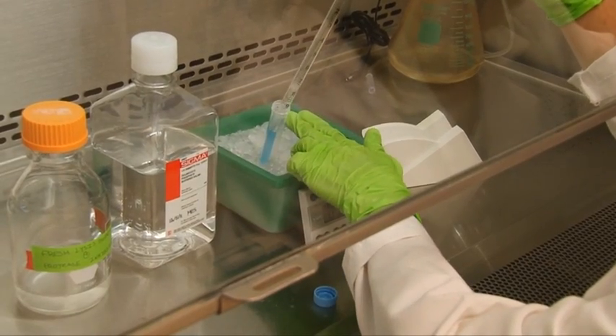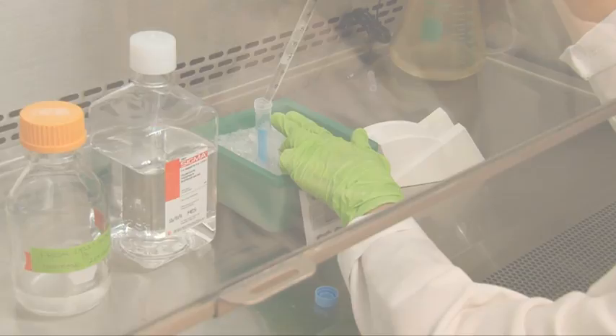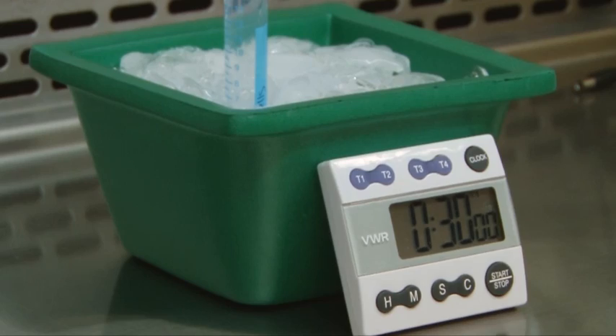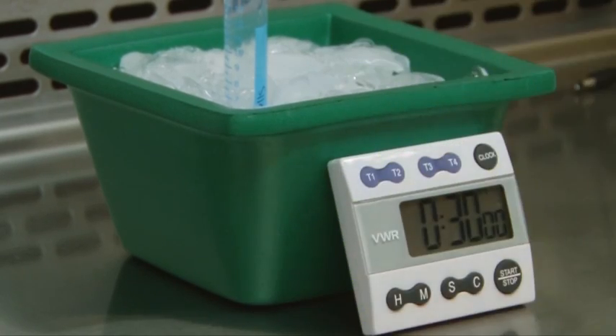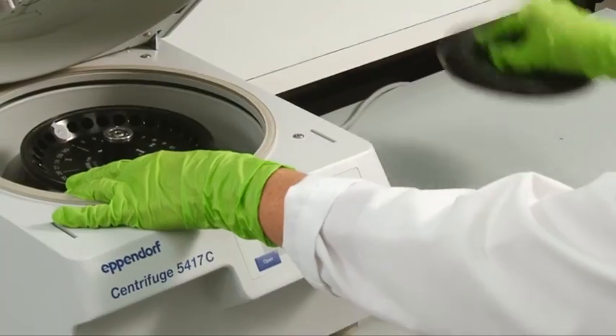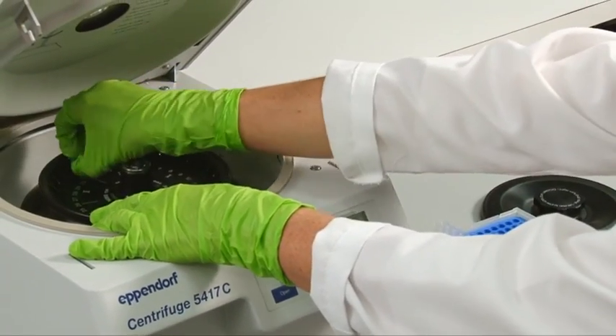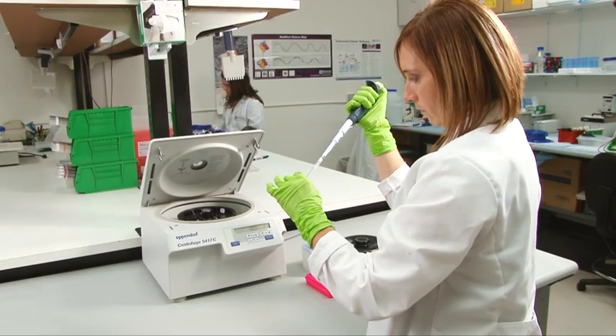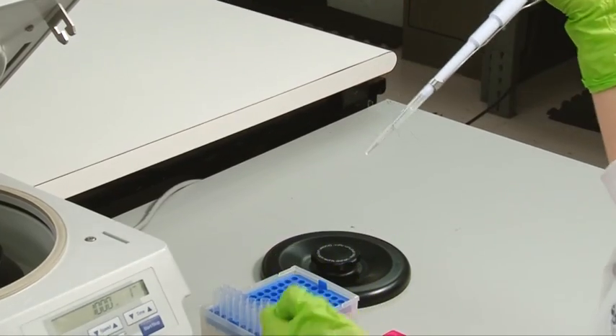We lyse the cells by pipetting up and down, followed by incubation on ice for 30 minutes. Then, centrifuge the cells into a pellet. Discard the pellet and collect the supernatant. This is your lysate.